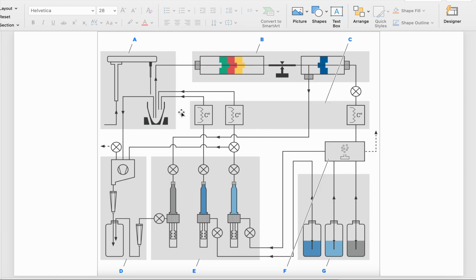Heating and also degassing are in process here. Then it's fed here, and the reference also is fed here again, and then the voltage difference is fed to the computer, and that's actually the result. That's the result. So that's it for me, the second video. I'll stop here.